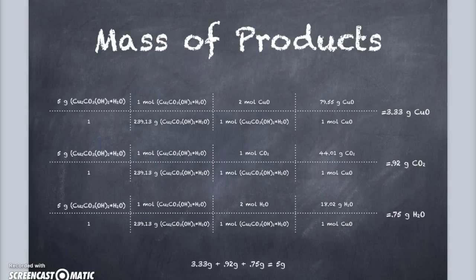We can also calculate the amount of each product we should have after the reaction is completed through stoichiometry, which we can use to confirm the identities of the masses in the experiment. These are the calculations that show the theoretical masses of the products. Here, we have the calculations of the product's masses using our data from the lab.